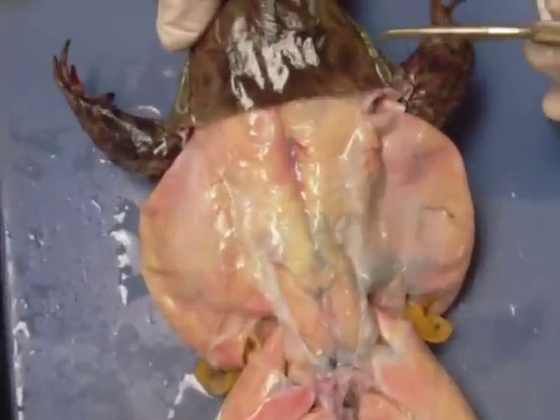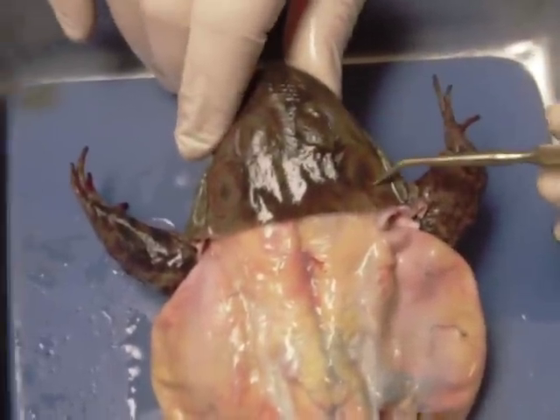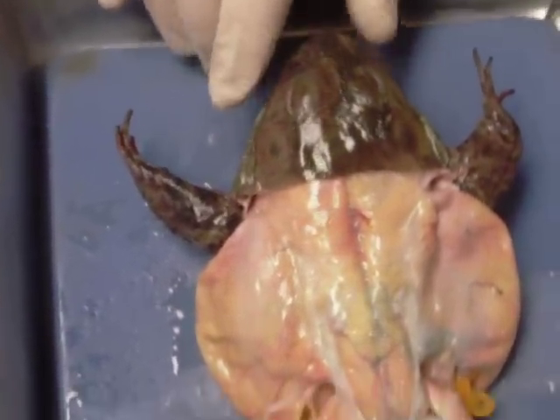You can tell it's a male superficially by the size of the tympanum. Here we have the eye, and here we have the tympanum. If the tympanum is bigger than the eye, odds are you've got a male.